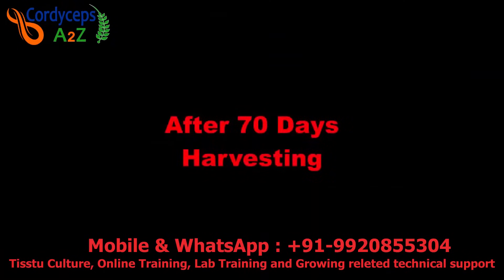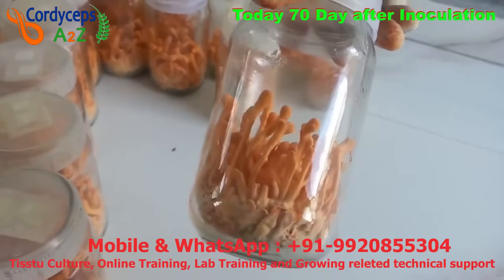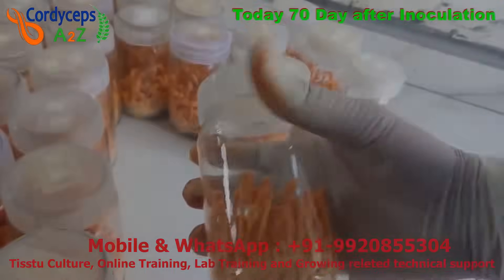After 70 days, the height of the fruiting body has reached approximately 6 to 7 centimeters. The fruiting body looks like a majestic shape — thick from the top and thin from the bottom. If you see this type of shape, the Cordyceps fruiting body is mature and ready for harvesting. Now we will harvest it.